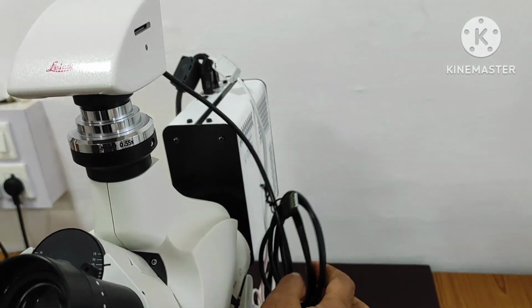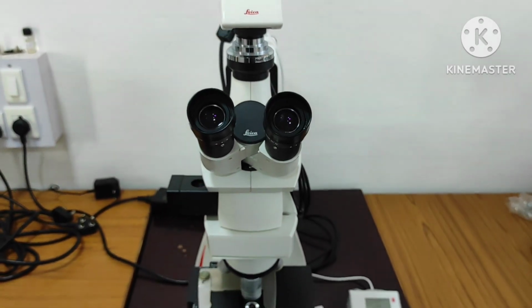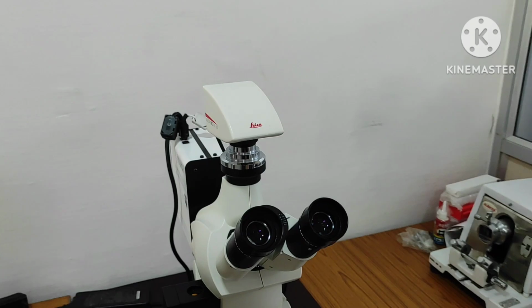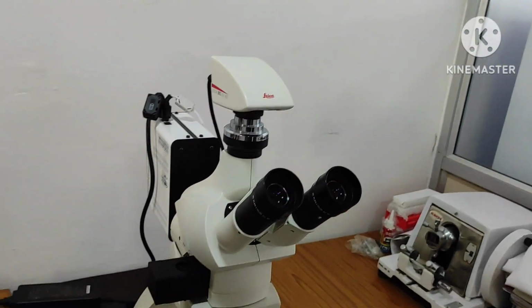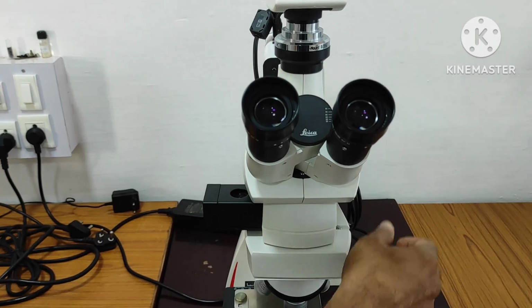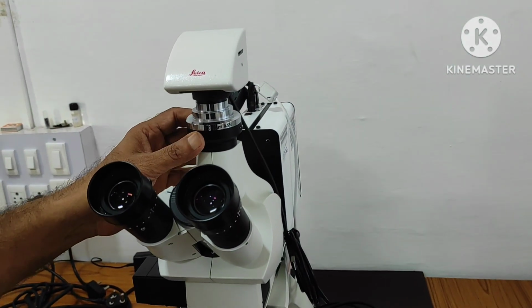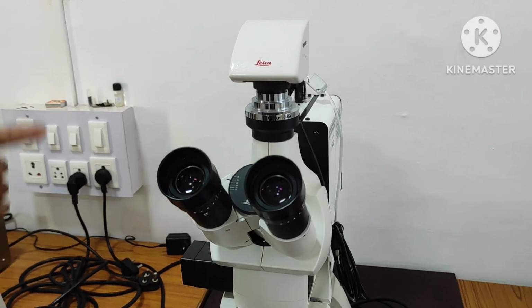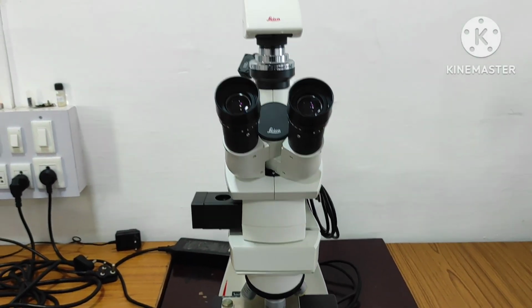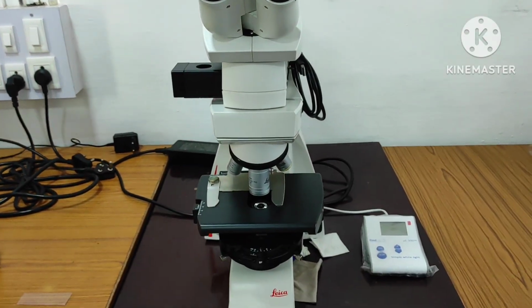So whatever we are observing on the microscope of the specimen, right, these can be captured directly. These images or videos we can make, capture and store in our system, because the USB facility is connected with this, right. So this is an extra facility. A good microscope always needs a good camera, so that we can capture images and make videos also. These can be stored even on a hard disk, right.